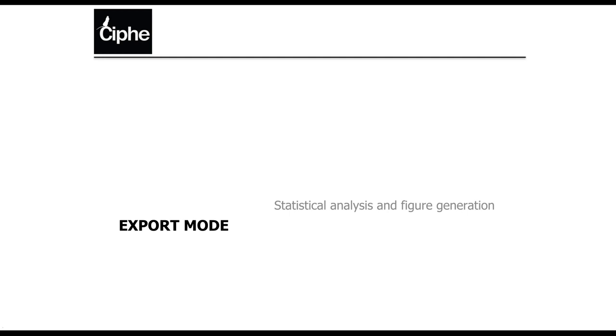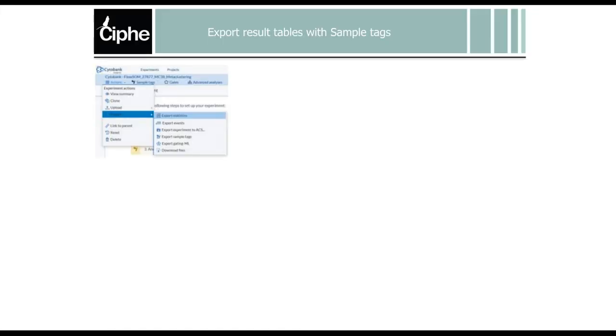Then the final thing I wanted to show is how to actually use Cytobank to export data. So it's not only a visualization interface. You can actually export a lot of different descriptive statistics that are embedded within the tool. And I wanted to show how to do that, and also how we can use the advantage of having a figure or an illustration that is driven by sample tags to very quickly generate a figure in publication quality and format through Cytobank.